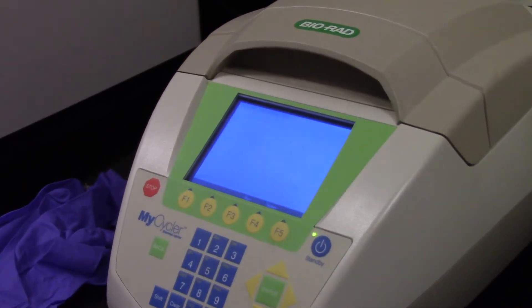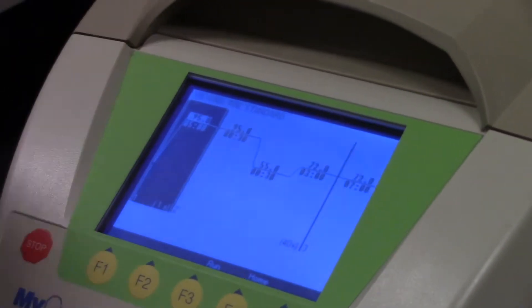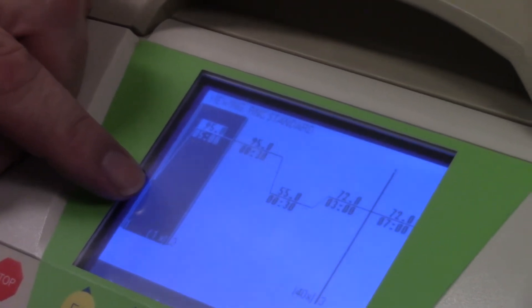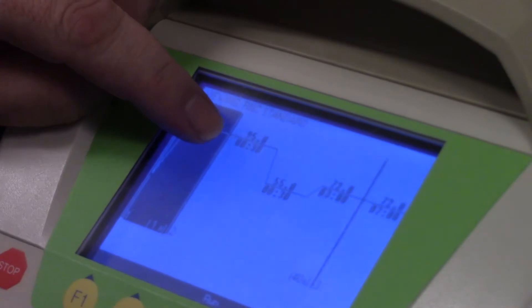Let me view the protocol. Notice that it starts at 95 degrees for 5 minutes. This is to make sure that all the template DNA is unzipped and available for primers to bind — and that happens only once at the beginning of the PCR. Then we start going through our three cycles, our three temperatures. Temperature 1: denaturing the DNA, 95 degrees for 30 seconds.